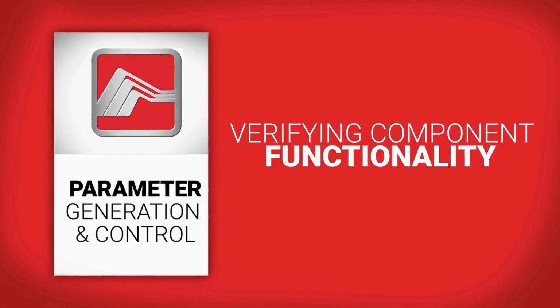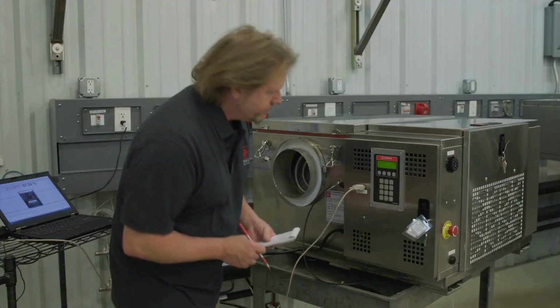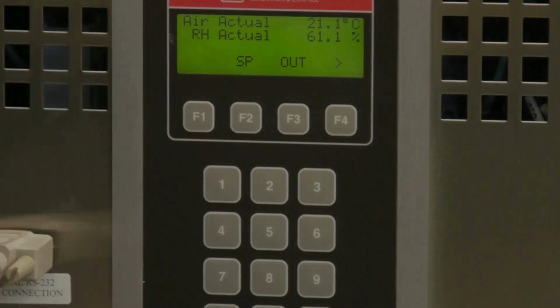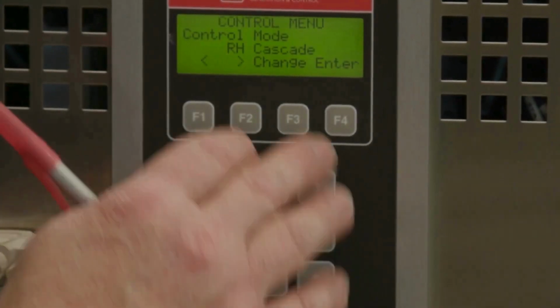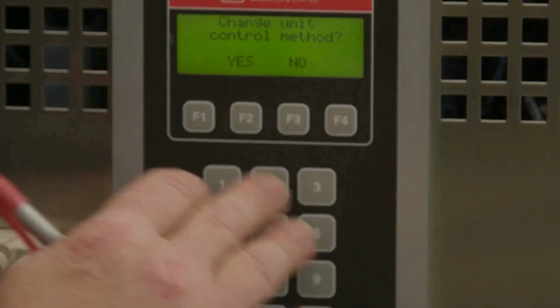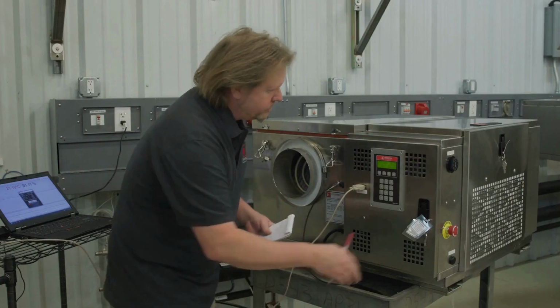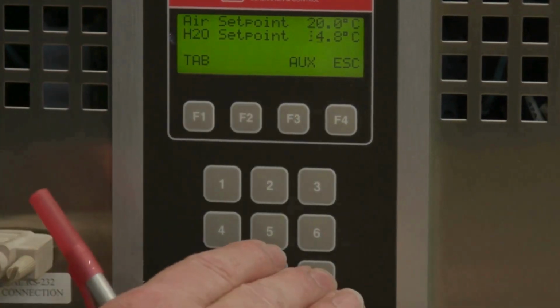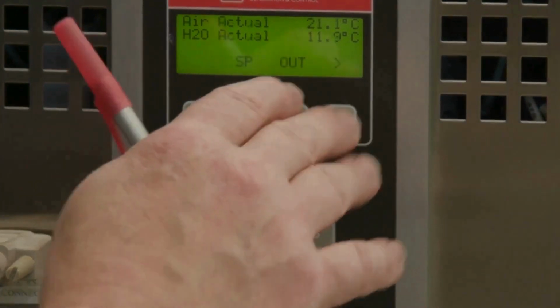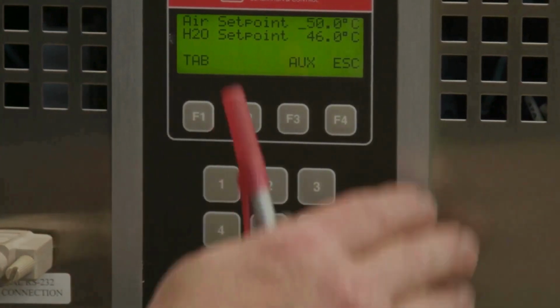We'll now go into a more in-depth look at verifying component functionality for maximum heating. Start by documenting the Smart Pad control mode. Configure the Smart Pad for 2 temperature control mode. Adjust the water set point in order to provide 100% water heater output. Adjust the air set point in order to provide 100% air heater output.